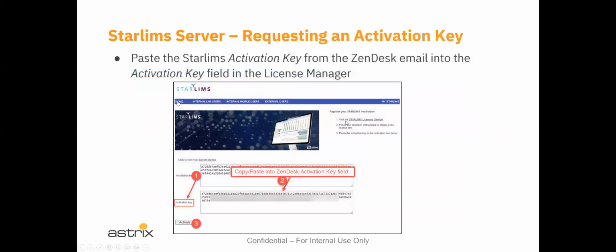I didn't show the result of it. Again, at the time, anyway, we didn't have an opportunity to cut and paste to show this information, and it's kind of sensitive anyway. But you would say at this point, after having activated, click the current license.